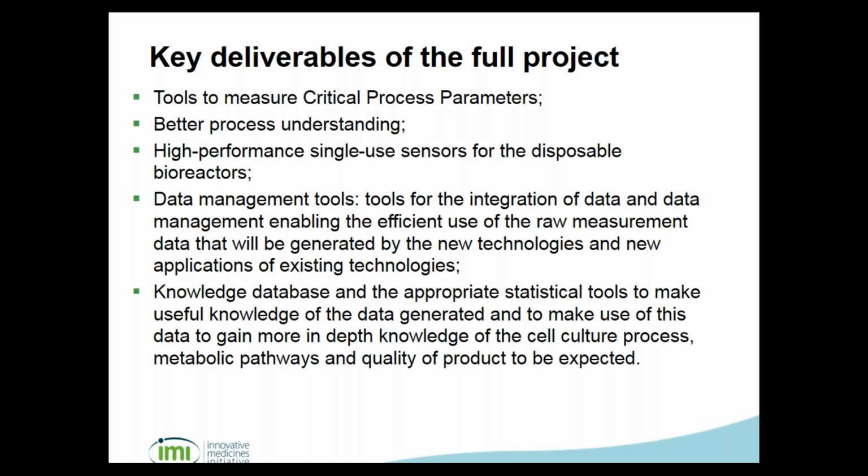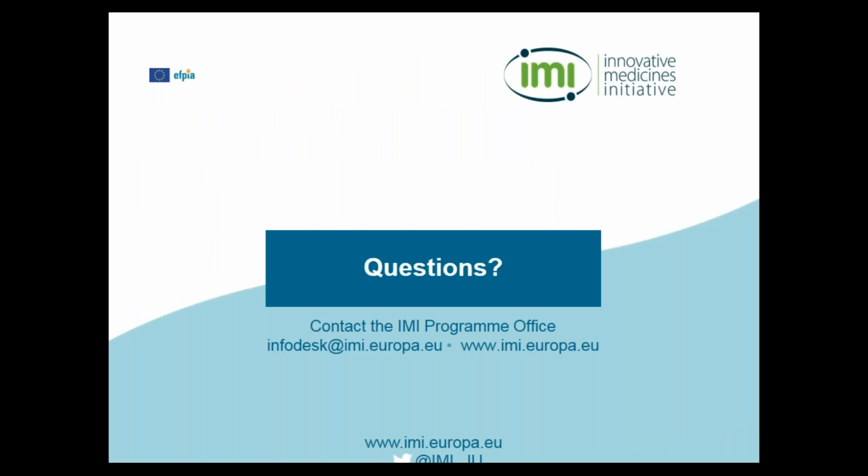We are also looking at data management tools, tools for the integration, making sense of data, and building also a knowledge database and statistical tools so that you, for instance, can do trending, all this stuff. Some of those already exist, but we are looking at new ideas, new approaches, how to tackle this in another way, so that we have maybe more insight in how our cultures are performing. Next slide. And I think that was the last slide.